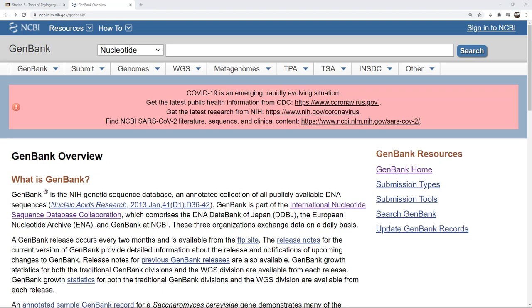There are several banks of genetic information. GenBank is one of those — probably the oldest and probably the most extensive of those types of banks that serve as a repository for genetic information. It's run by the National Center for Biotechnology Information, or NCBI, and that's why you see the logo up here on the left.